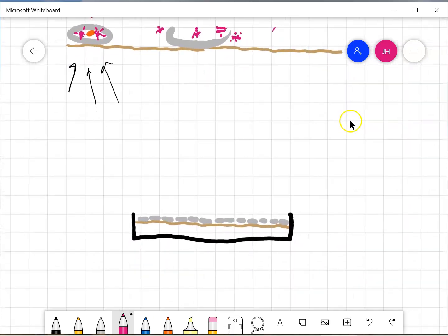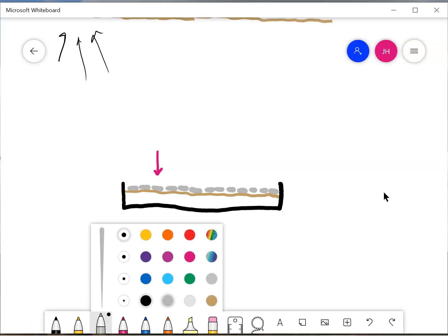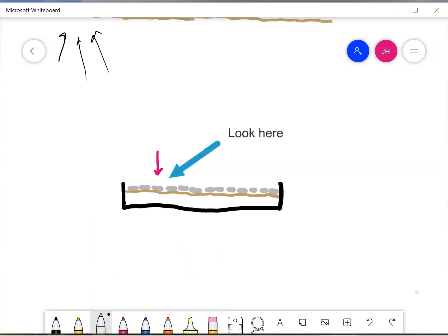Well, let's just imagine we have a layer of host cells covering the entire surface of an agar plate. So we've put host cells here, and they have grown slowly, but they have grown all along the surface of the plate. So what happens if we put a virion here? What if we put a virion in this cell? Well, what's going to happen? The cell is going to break open. So this cell is going to break open, and the cells nearby it are going to break open.